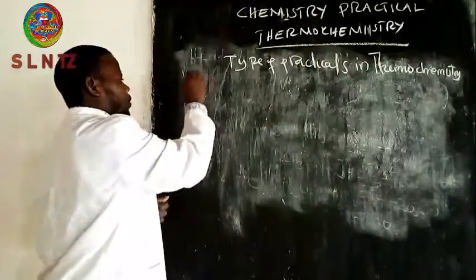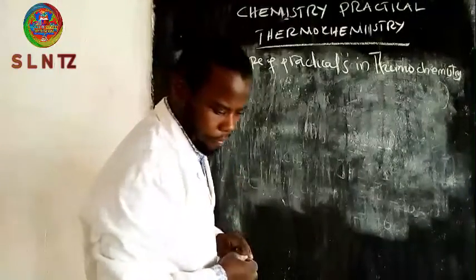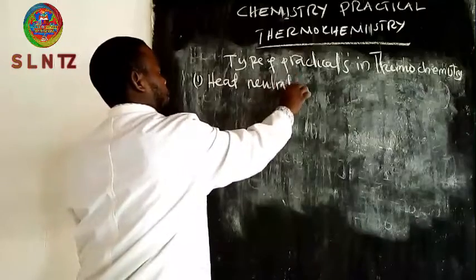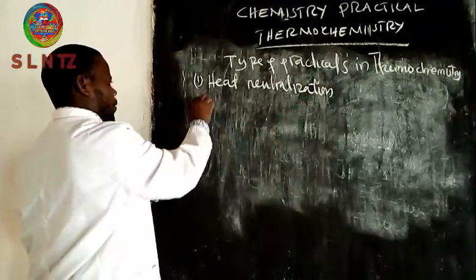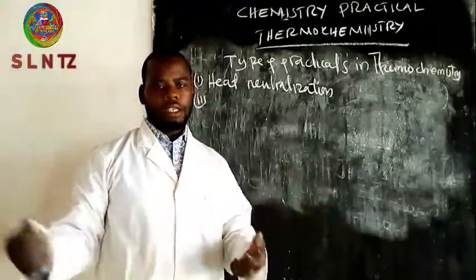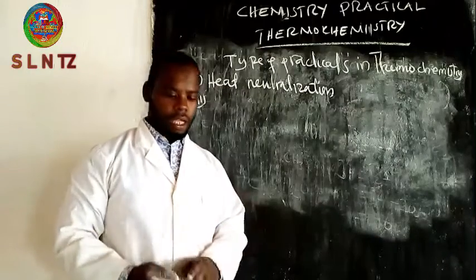The first practicals deal with heat of neutralization. We're going to take a base and an acid and make a neutralization reaction. There is a heat change, and then we are going to see the experiment.